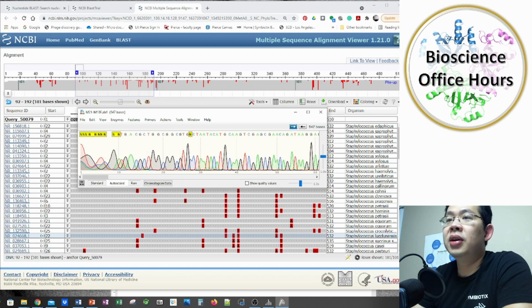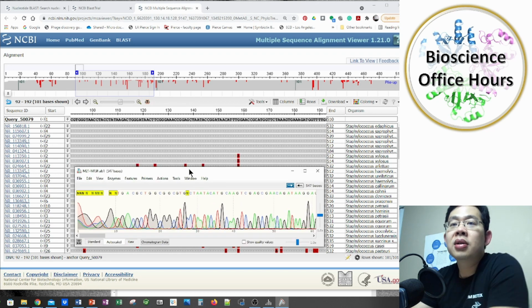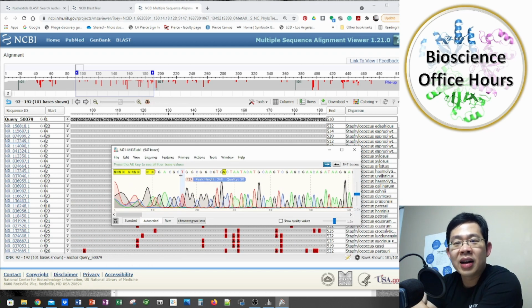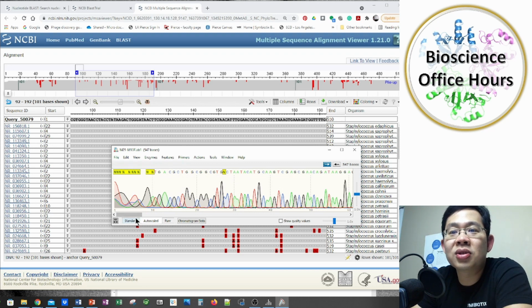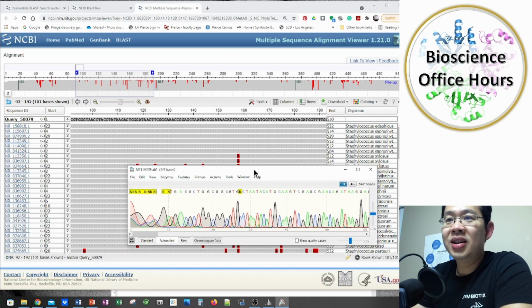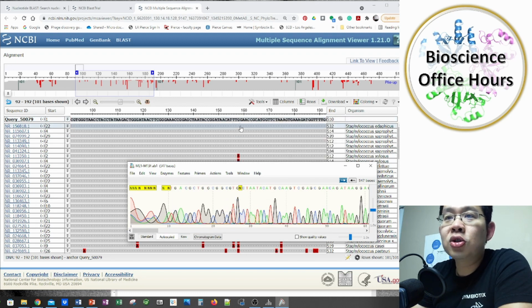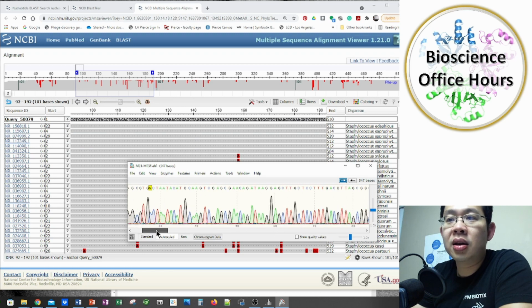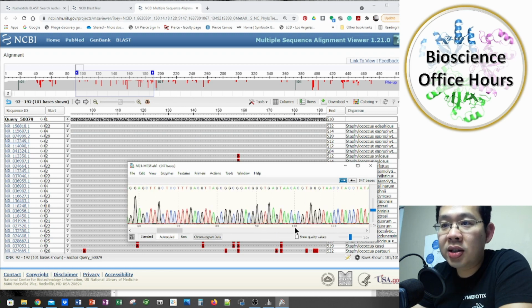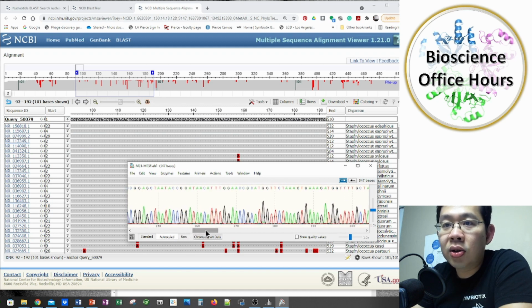So here, where's my trace file? Okay, so here, at this position number, remember we trimmed this already in our sequence, so it's really hard to see what they are, but I guess we can do it using brute force. So let's say this is what this is, let's find CATTT-GGA, and it's close to base number 160. So let's go to base 160. This is 100, 110. Let's take a look at 160, close to 160, and we want to find what?